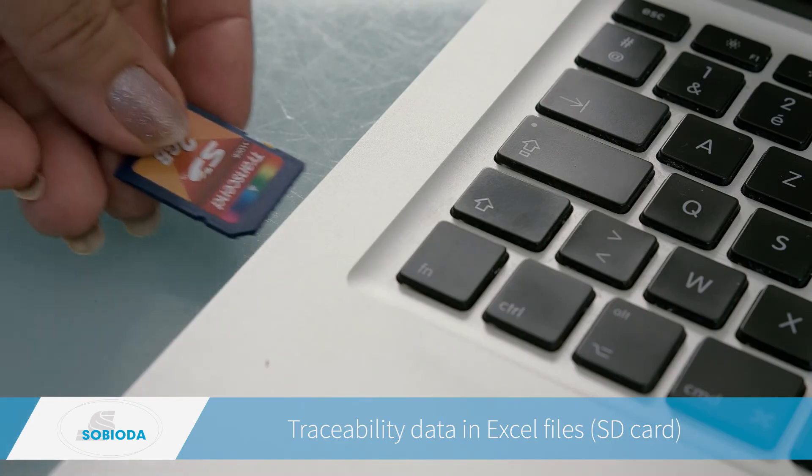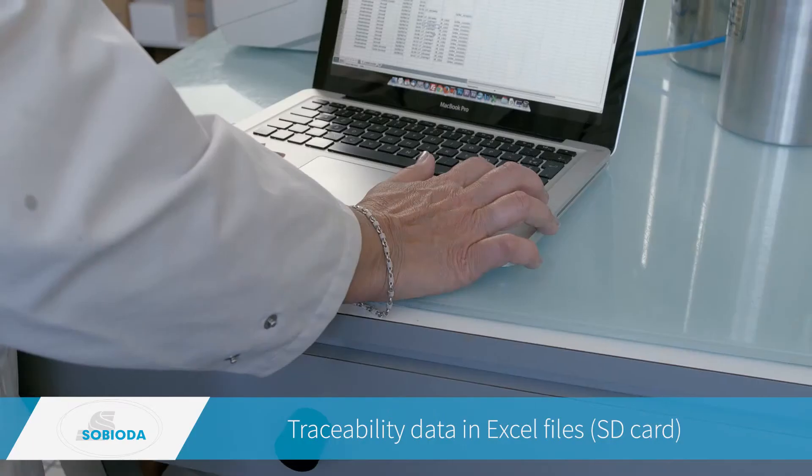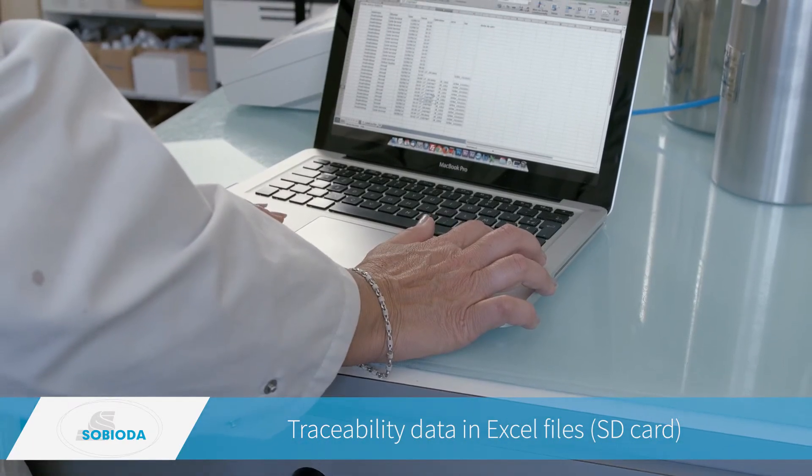Step four: traceability data are saved on the SD card and then transferred to the computer in an Excel file.